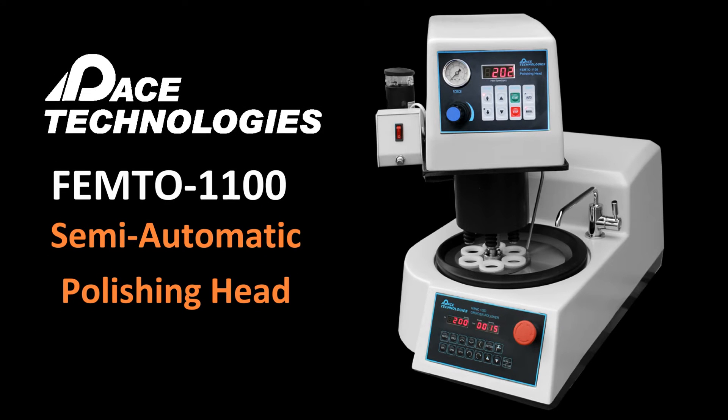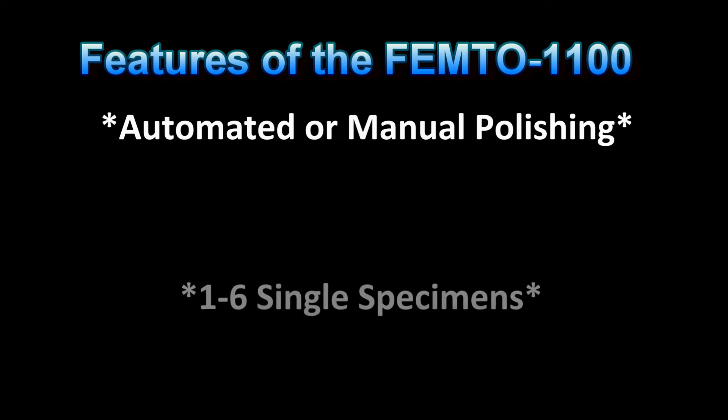The Femto 1100 is a semi-automated polishing head attachment for the Nano 1000T and 2000T polishers. The primary benefit of the Femto 1100 is increased throughput and polishing consistency. It features the ability to automate the polishing process and to prepare one to six samples individually.